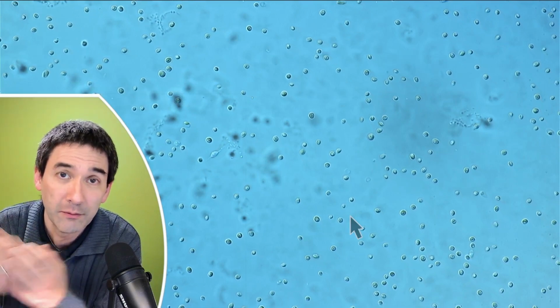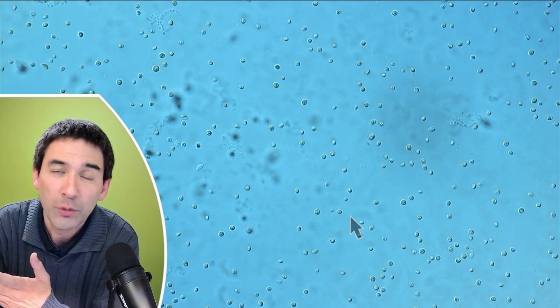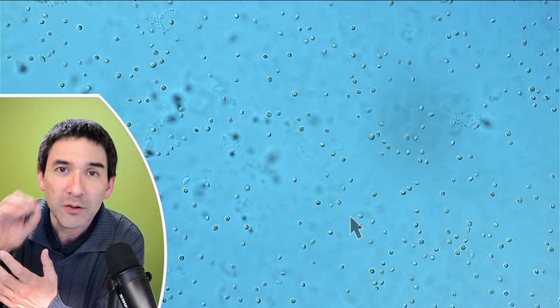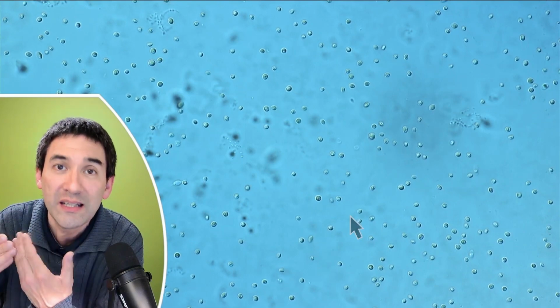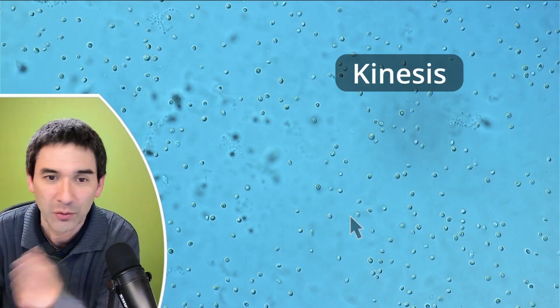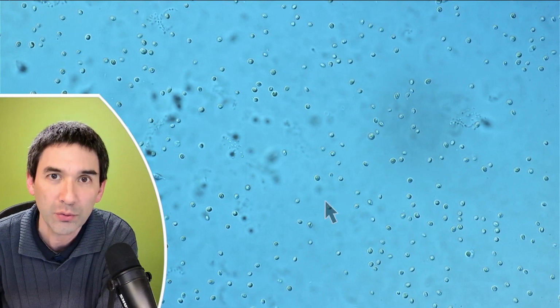How would the microorganism then know into which direction to move? Because the stimulus is not coming from somewhere. And here you have again random motion. It's called kinesis, and what they do is the following. I'm just going to trace this out now with my arrow that you have here. The microorganism is simply going to move around on its own randomly.